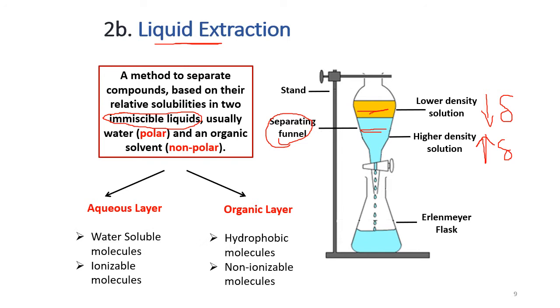If we have an alcohol and ether, for example, then they will be the ones of lower density, which is less than 1, where 1 is the density of the water or any aqueous media. Okay, so again, we need to separate two layers. One of them is aqueous and one of them is organic.